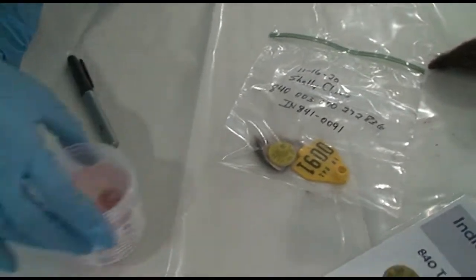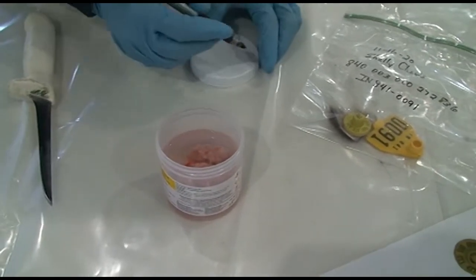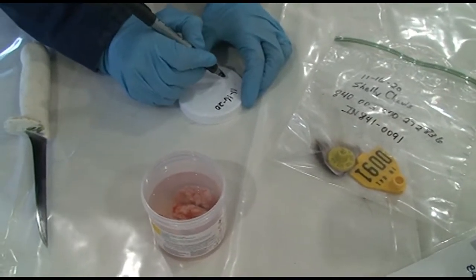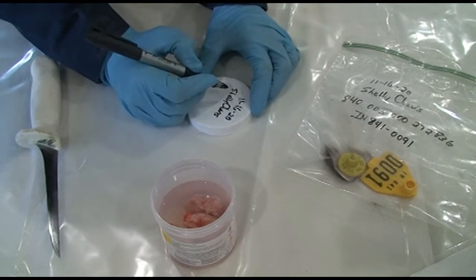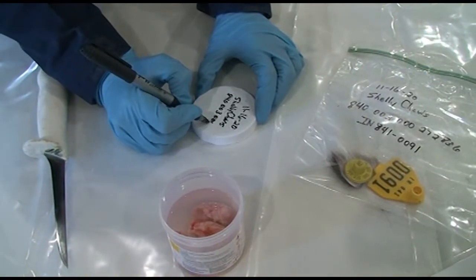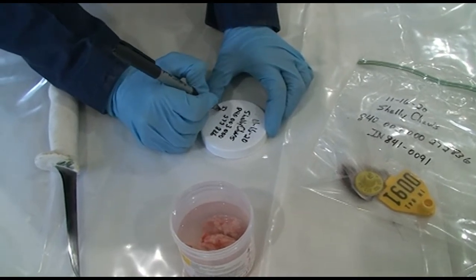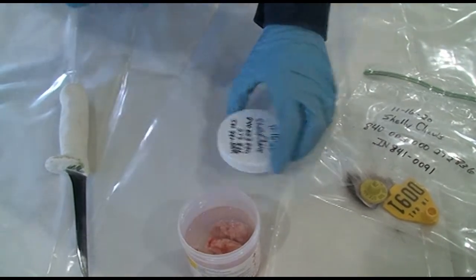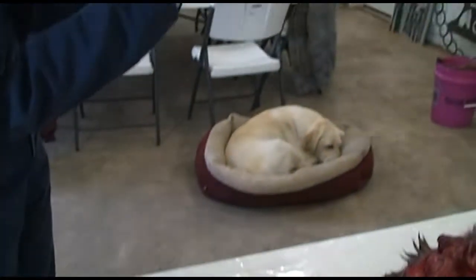And then your formalin jar that has the samples that we put in it, you also want to label it the same way. A lot of times we recommend you label the jar, but you also can label the lid. Sometimes, just in case the lid would ever get separated from the jar, it's nice to be able to see from the top what the numbers are. But you want to make sure you label your jar also, in case the lid would get separated. So we label the lid, and then we also label the jar.